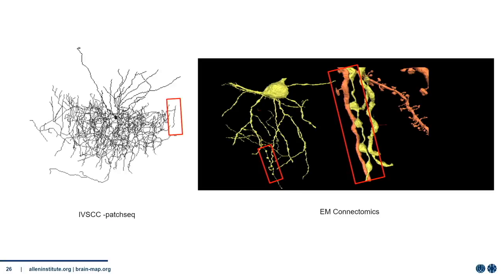And here is one example from our data set, and here you see now the axon targeting the initial part of the segment of a pyramidal cell. And again, look at this beautiful dendrite with all these spines reconstructed, again, fully automated. So I'll see if we can get to the web browser.